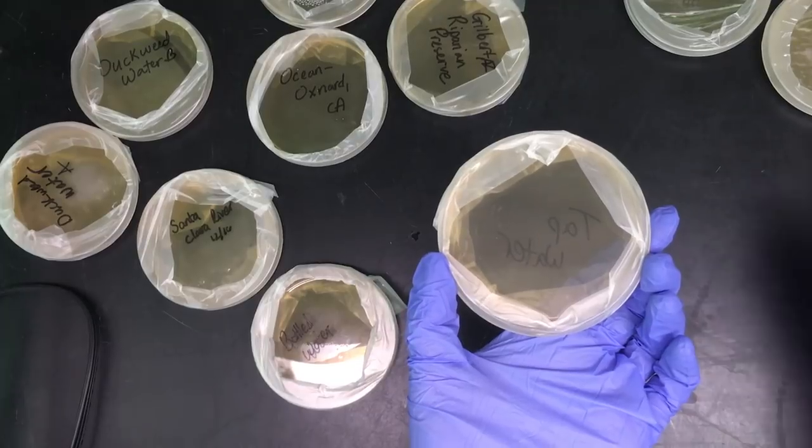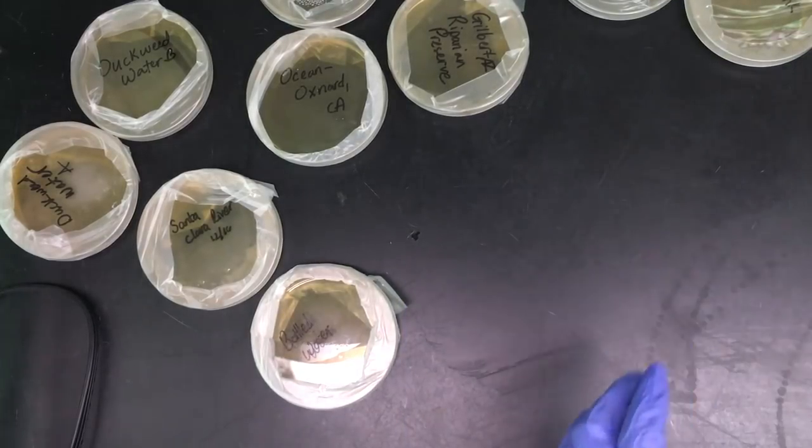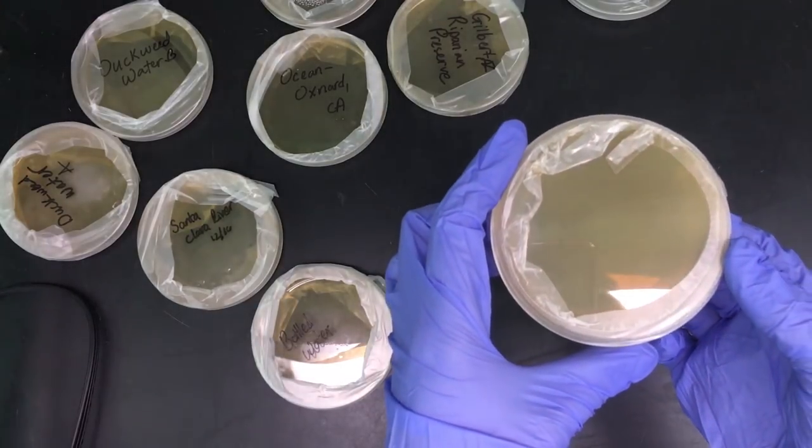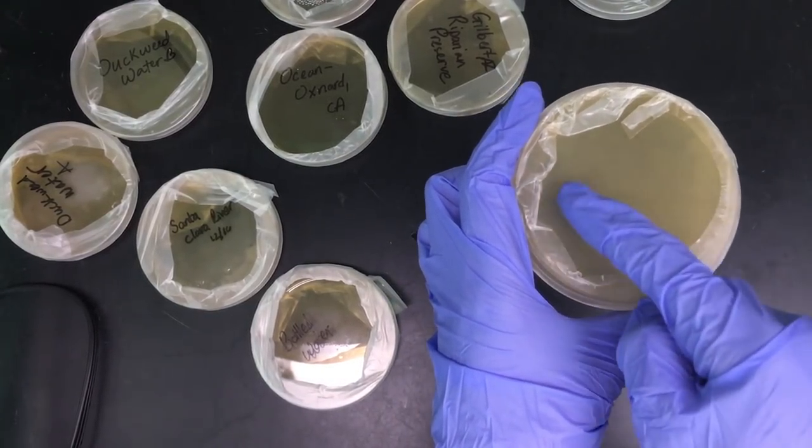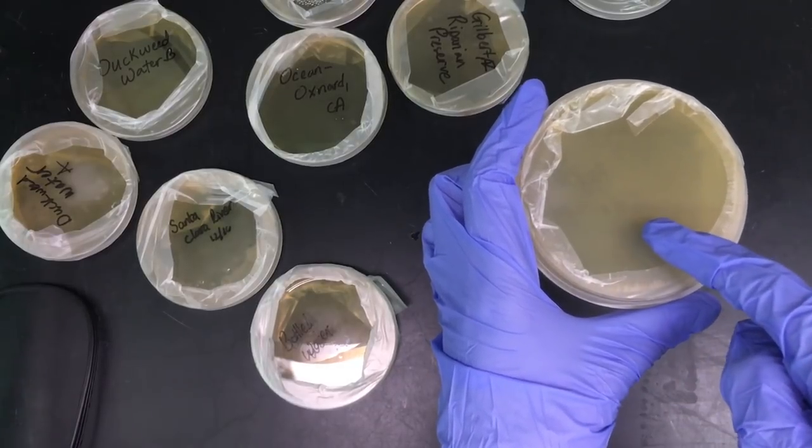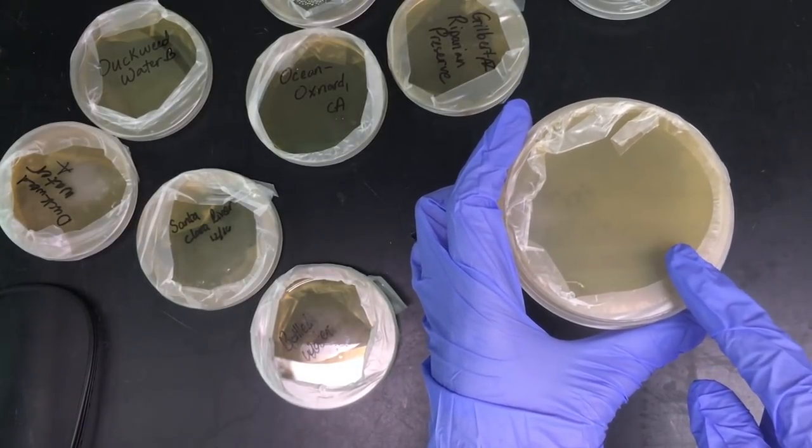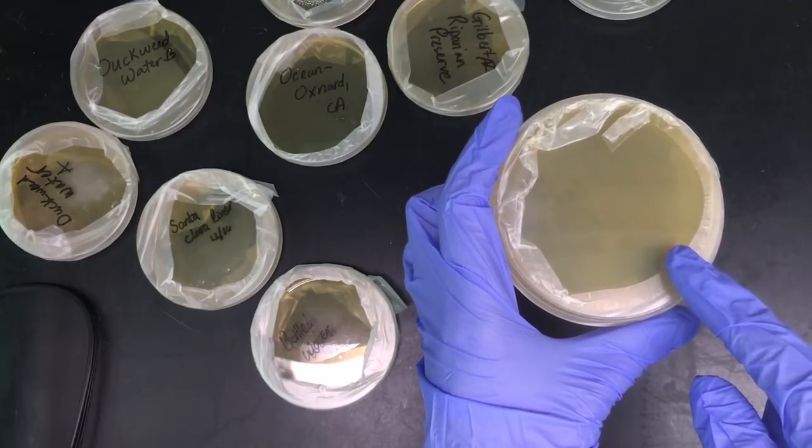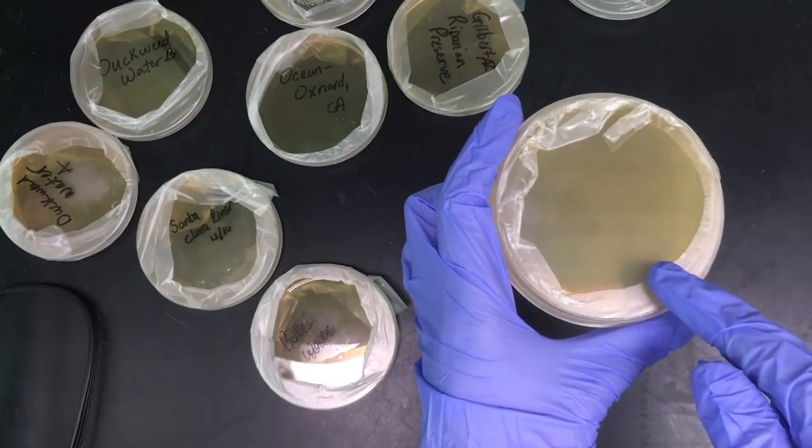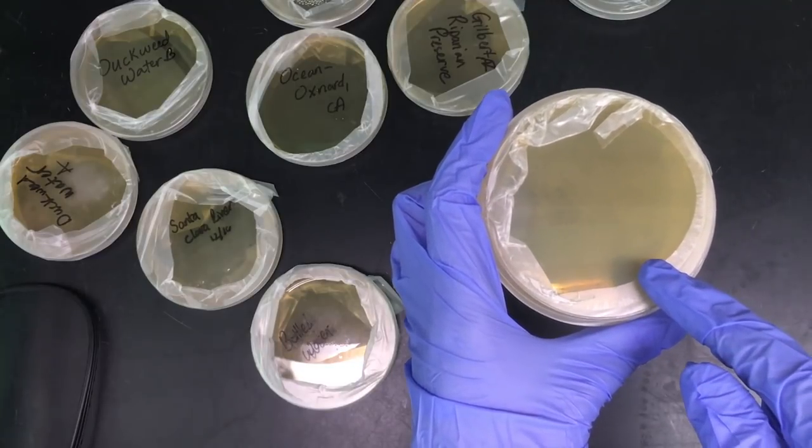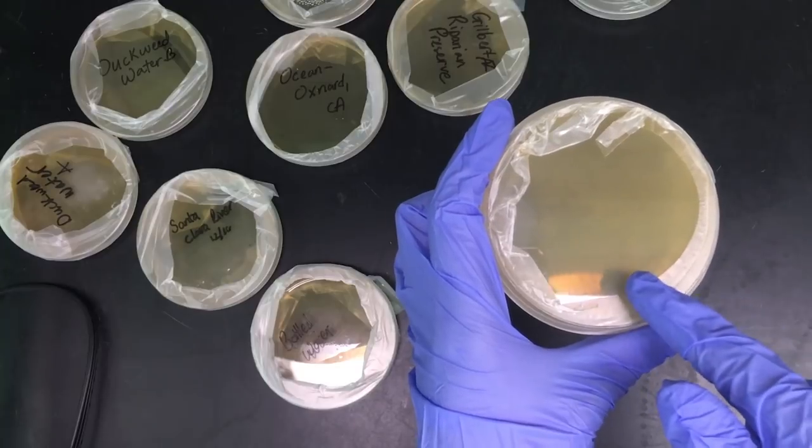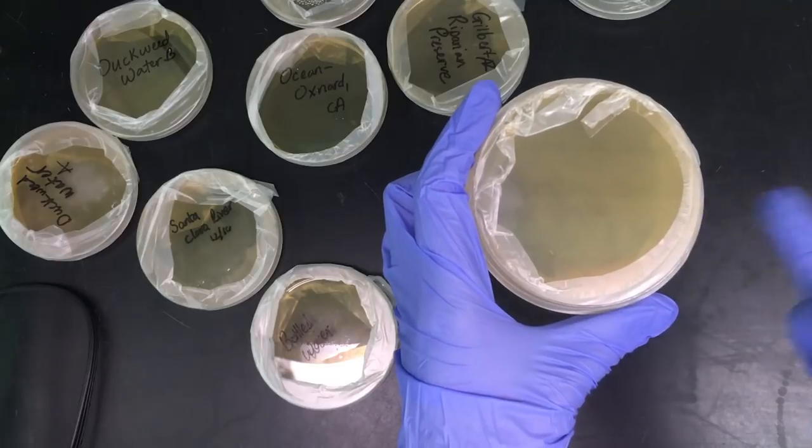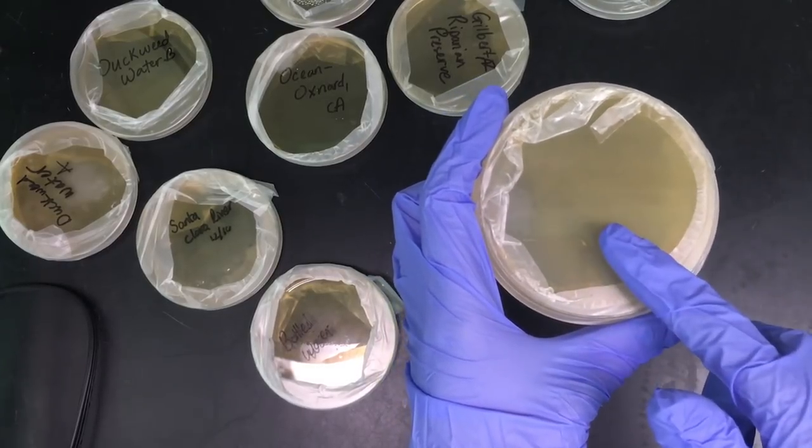Next we'll look at our fish tank. So our fish tank actually grew bacteria and you can see some kind of large colonies in here but not coliform, so it's negative for coliform bacteria. The coliform bacteria are kind of a light pink circle. Now our fish tank water does have good bacteria in it, beneficial bacteria, and so that's what we're seeing growing but not coliform. Coliform bacteria comes from mammal feces and so there are no mammals in my fish tank, so this is normal for it to come back negative.